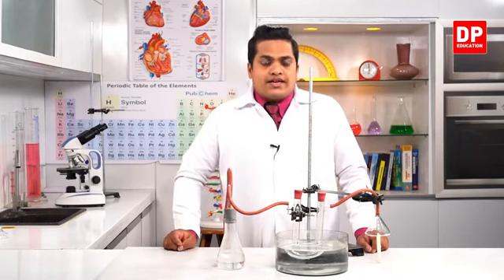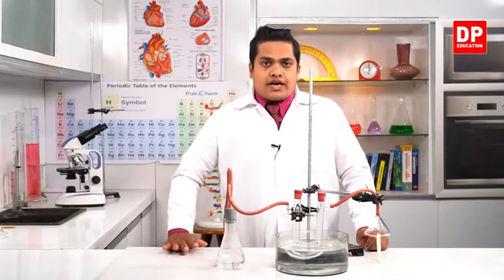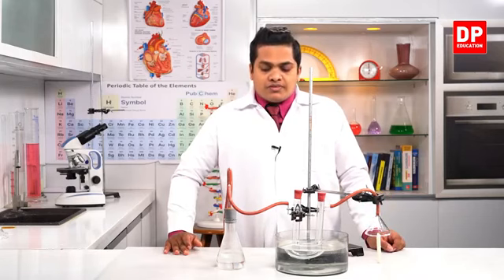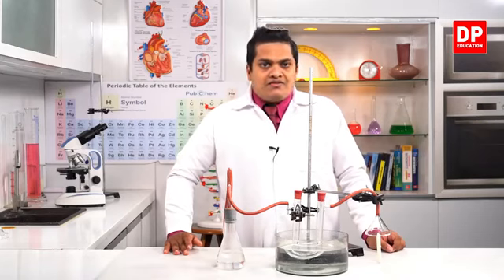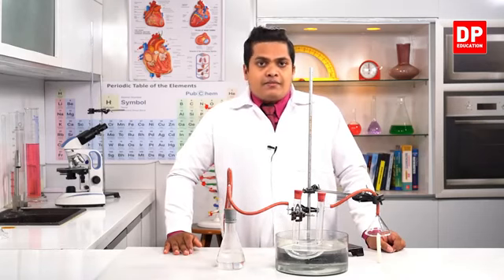So getting observations would be quite difficult. Therefore, the aspirator provides enough time to get a good observation from the experiment. So we'll conduct the experiment and see what our observations are within this setup.